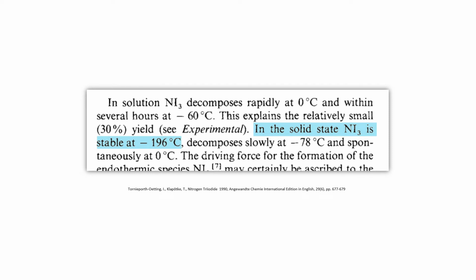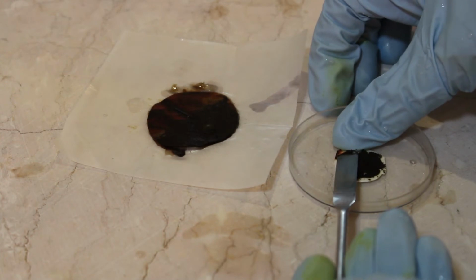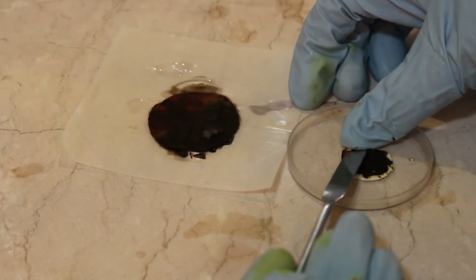This scientific manuscript confirms the theory with this exact sentence: in the solid state NI3 is stable at minus 196 degrees Celsius. So let's get started. To do this, I redid all the steps again with the difference that I piled up the nitrogen triiodide in a container to hold the liquid nitrogen.